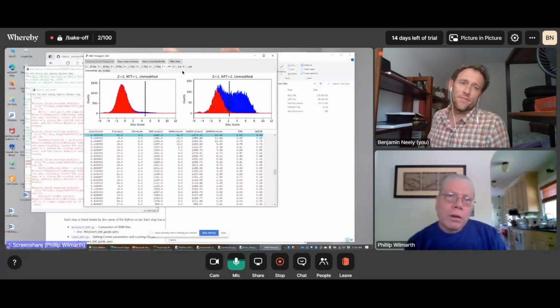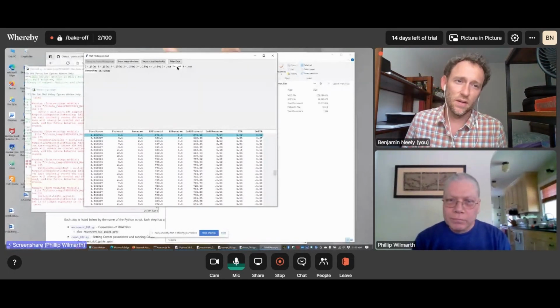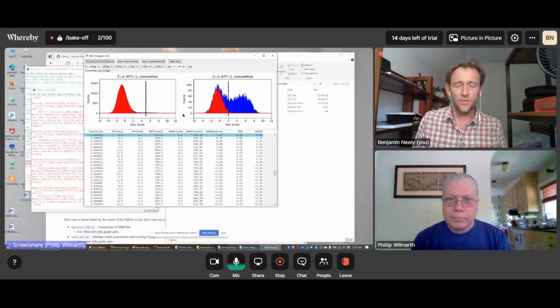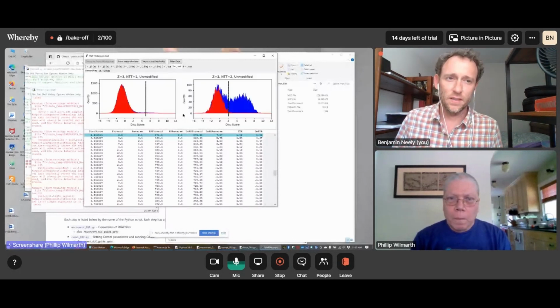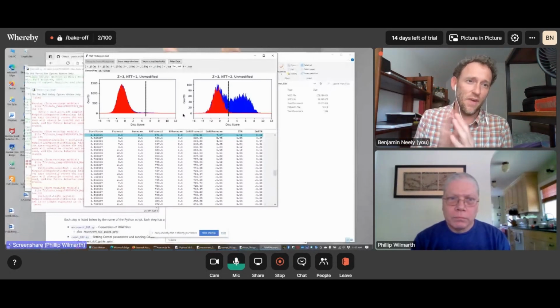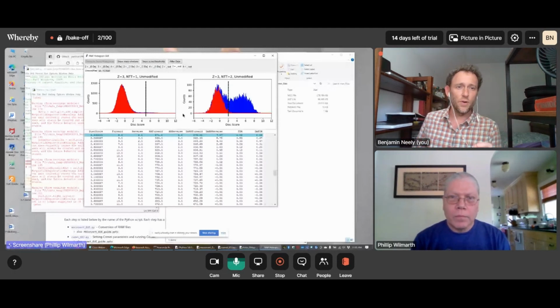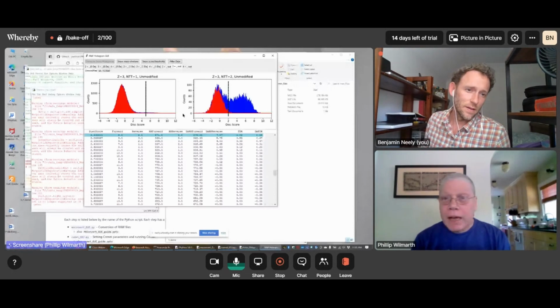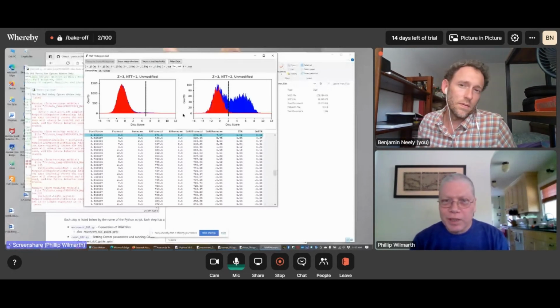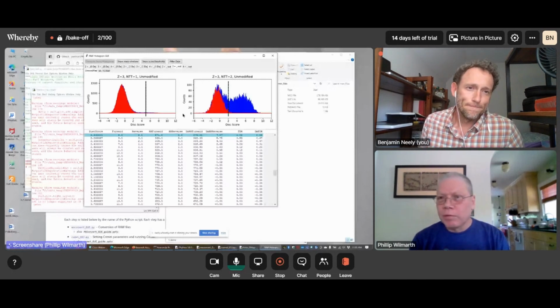So I feel like what you just said kind of blew my mind. So you've got some fragmentation pattern, but what do you mean there's no accurate mass? So it triggered something, it let something in, it fragmented. You have the fragmentation that you can make an identification with. But what do you mean there's no accurate mass? You don't have an isotopic pattern. Maybe instead of several isotopic peaks, you only saw one single spike above noise level. Mm-hmm. You don't know its charge state. You don't know anything about it.